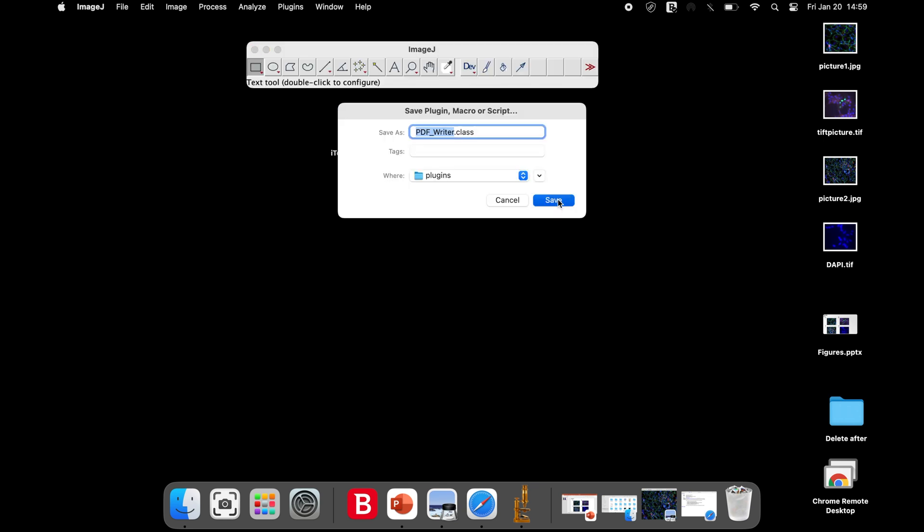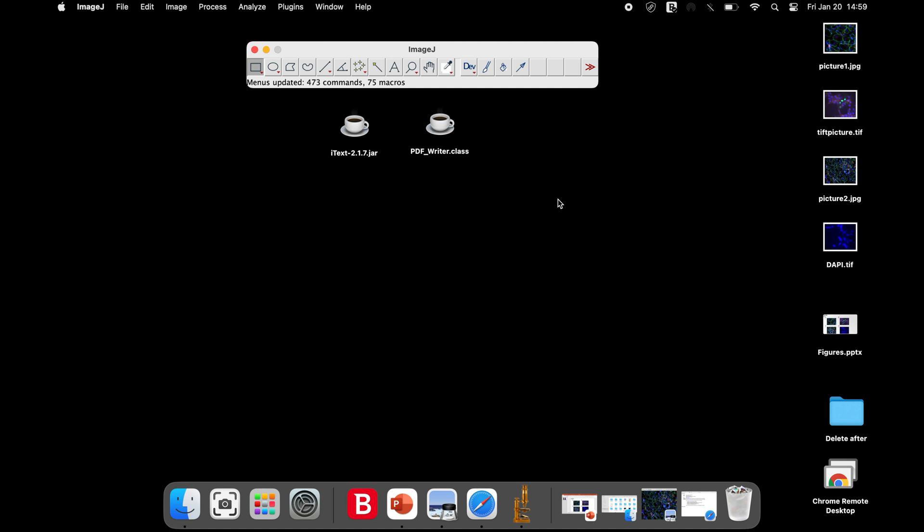Now, the ImageJ software can be closed and restart it again.